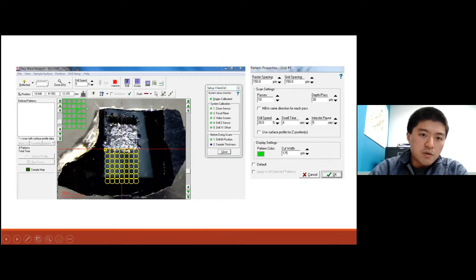So note that in order to create open cavities like this using a cluster of single drill holes, the holes are actually plotted so that they overlap a little, just to make sure the material in between actually gets milled out as well.